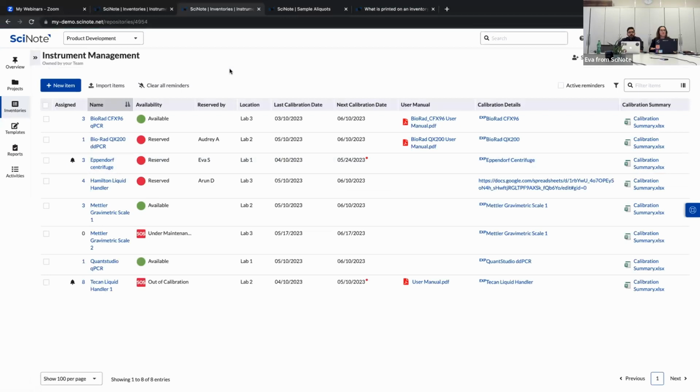And now I'm going to give you an overview of what information I've captured in this inventory that I've created. Quick disclaimer, you may choose to capture more information at a more detailed level, or you may choose to keep it a little bit more brief. That's entirely up to you. Of course, if you have any questions or need any recommendations, you can always reach out to us or your CSM, and we can guide you in how best to create the inventory for your specific use case.